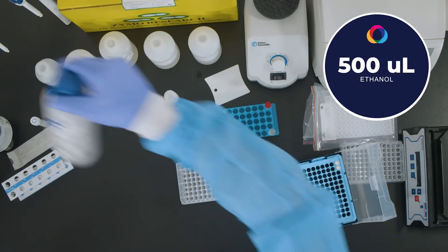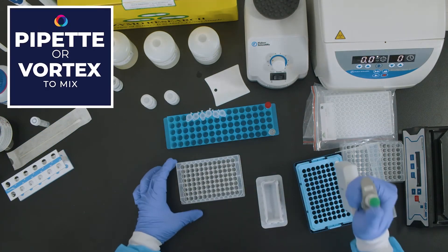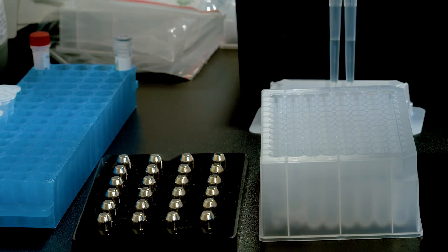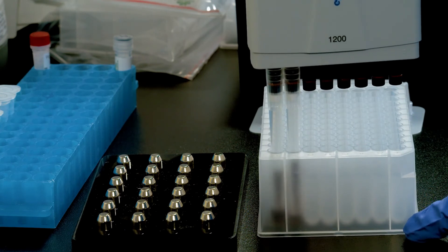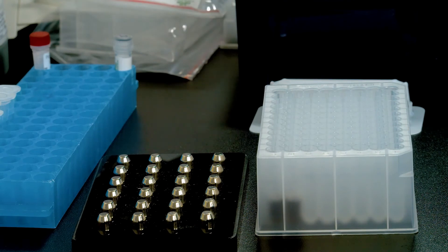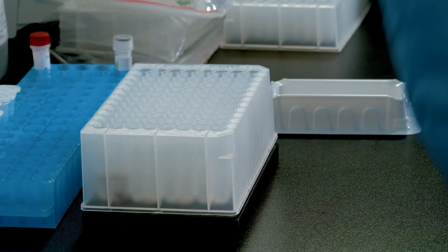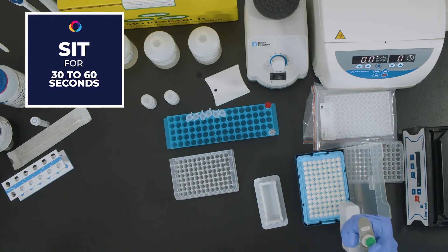Add 500 microliters of molecular biology grade ethanol, 95 to 100%, and pipette up and down to mix in plates or vortex to mix in tubes. Note: ethanol is not included in the kit. Transfer the plate or tubes to a magnetic stand and allow to sit until the beads have pelleted, approximately 30 to 60 seconds. Aspirate and discard the supernatant and retain the pellet.